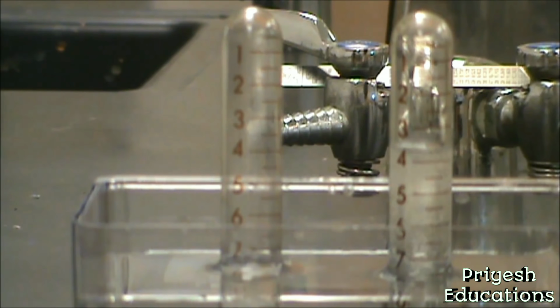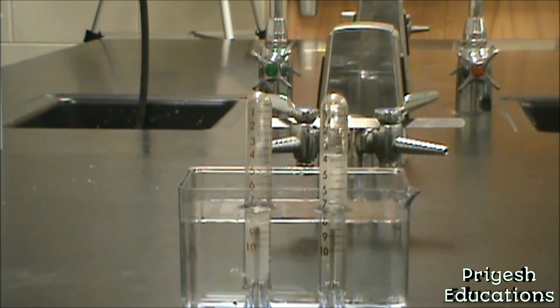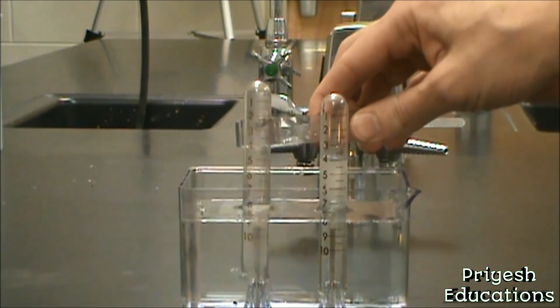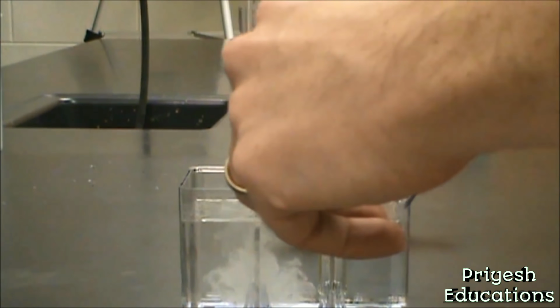So now we need to test what those gases are. To do that, we're going to do a simple splint test. Let me zoom out a little bit. So our test tube on our left here, the one that's filled up with more, we're going to test that first. We're going to let the other one go for a little bit while we do that test. To test that, we're just going to pick it up and insert a flaming splint into it, see what it is. This is the one that has more gas present, about twice as much gas. So we're going to let the solution pop out of there.